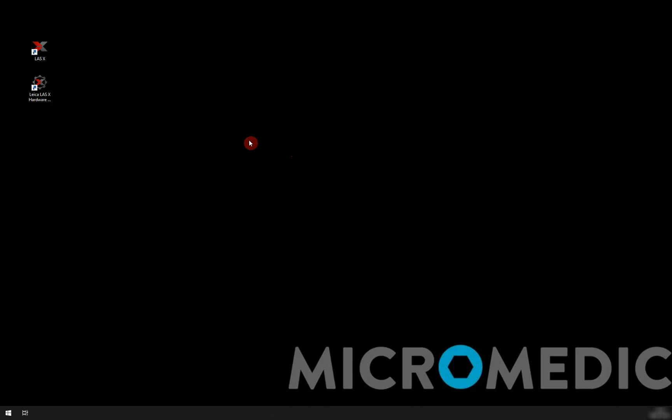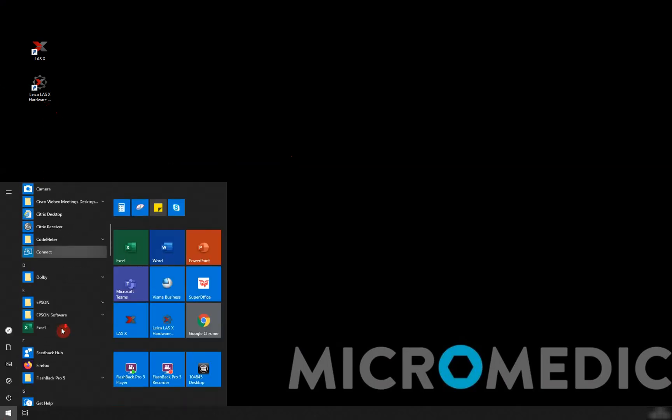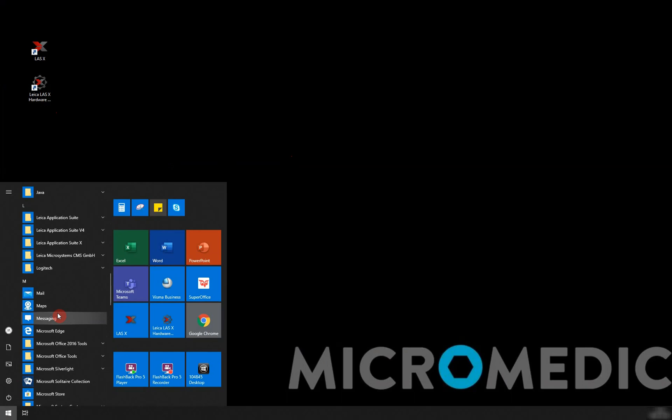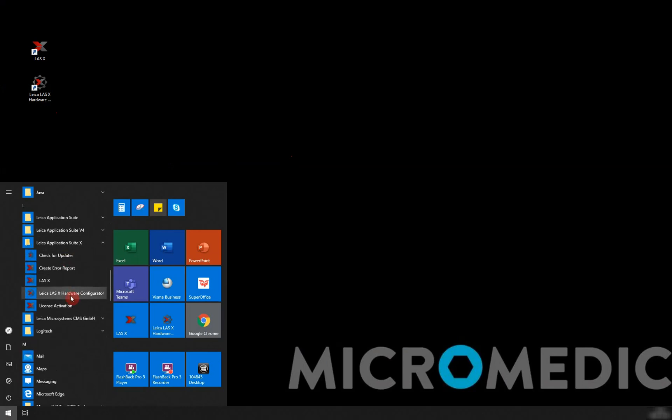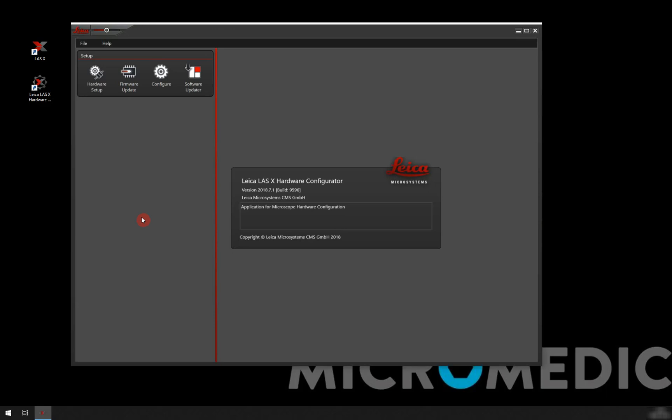To set that up we're going to start with the LSX hardware configurator. You can find that either on your desktop, but if you can't find that icon there, we can also find the program by going through the start menu and going to the LSX folder.